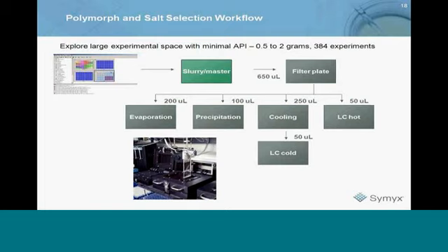Occurs. So there's some limited degree of control that is able to be there, but it isn't really control. It's mostly just doing a faster or a slower type of evaporation that can be done.